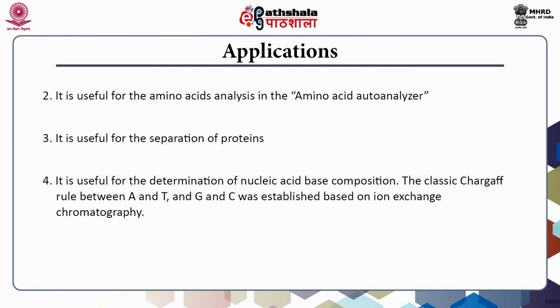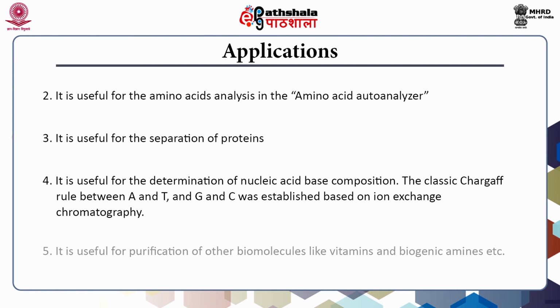And in addition to proteins and nucleic acids and also simple water purification, ion exchange chromatography can be used for many other purposes, for example, the purification of other biomolecules like vitamins and biogenic amines, etc. These are the main applications which we have discussed in this lecture, but there are many applications for ion exchange chromatography in several industries.